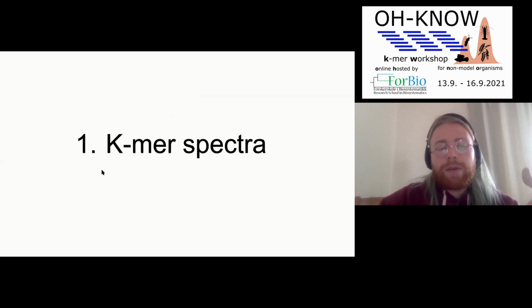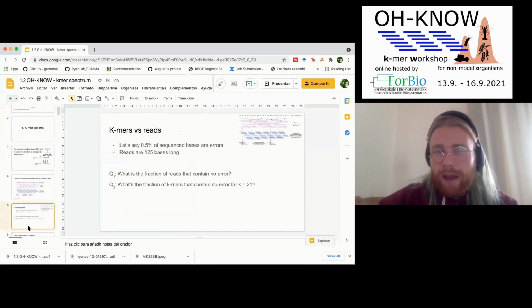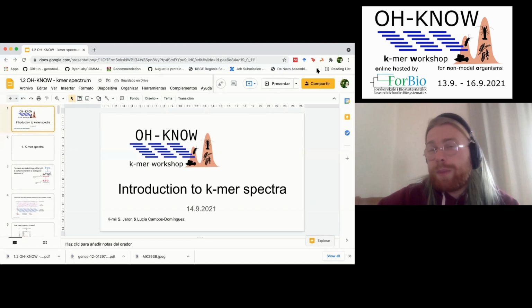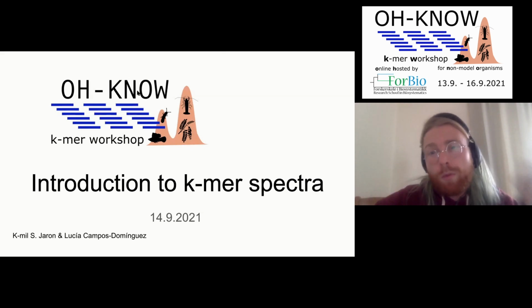And basically, different technologies have different distances from uniformity. While Illumina is quite good in the error profile itself, it's not perfect. They have a coverage bias towards GC sites, but they almost don't have any indels, while the Oxford Nanopore has lots of indel problems. So it's, again, a completely different error profile. So perhaps we should not ask if it's random or not, but what's the distribution that drives the randomness?